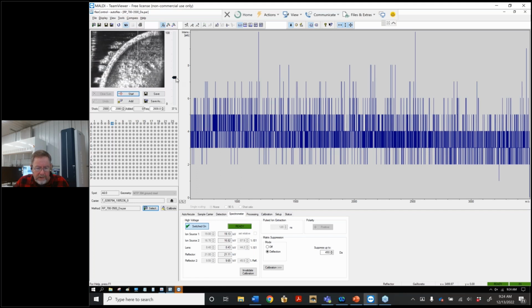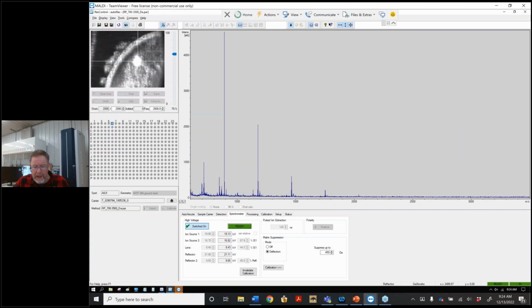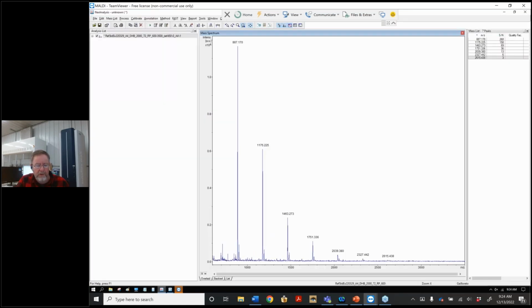So what I can do is show you just how quickly we can adjust the laser power and reshoot this sample. And now we see this real beautiful oligomeric series of trimers, tetramers, pentamers, hexamers, heptamers resolve. So very small changes in the operator's environment can quickly resolve these compounds from baseline noise. I'm going to switch to the Flex Analysis software. So once the data has been acquired and saved, we come into a second software package where we can actually inspect the data with a little bit more intensity here.